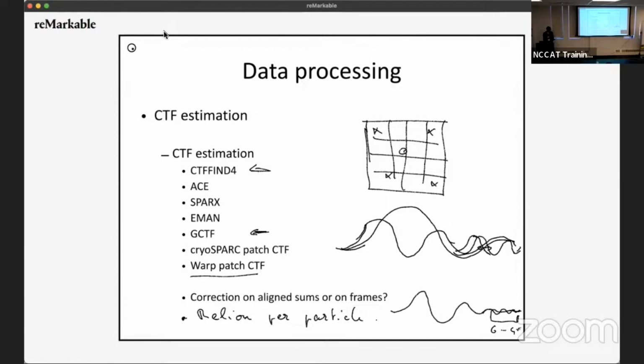All right, so again, which defocus value is still fine to get high resolution data? Again, I haven't seen a good study on that, and that study is easier because you can just reconstruct volumes for different defocus values and look at the B factor of those different reconstructions and see at what point you start to really lose out.